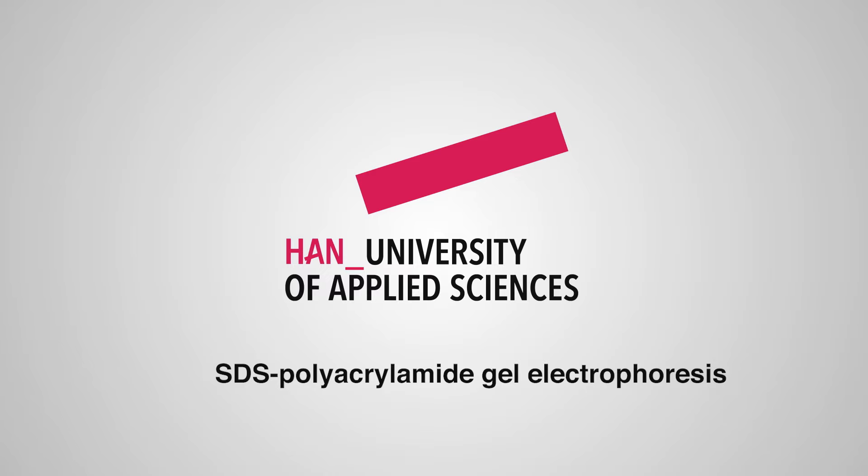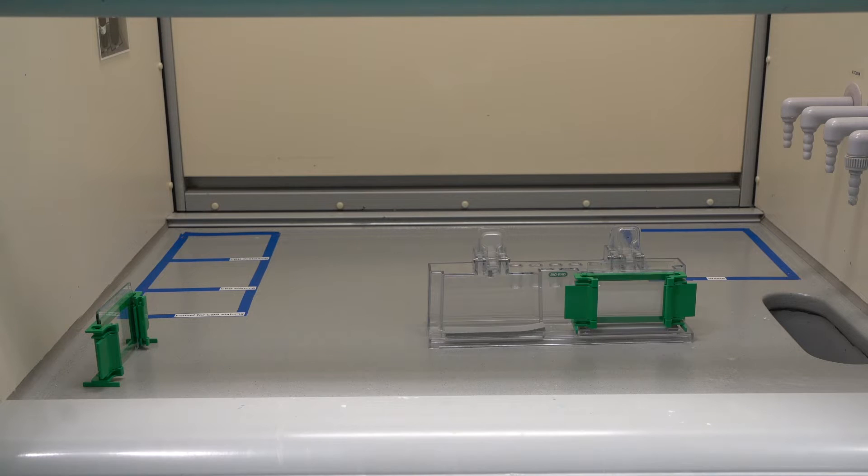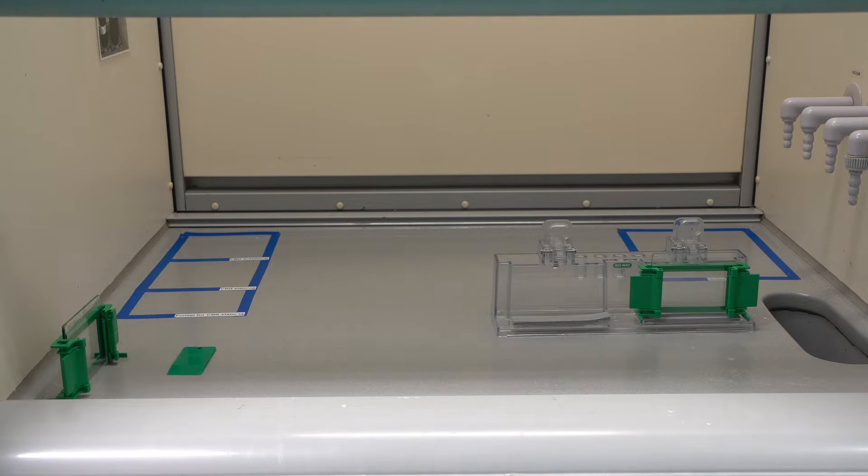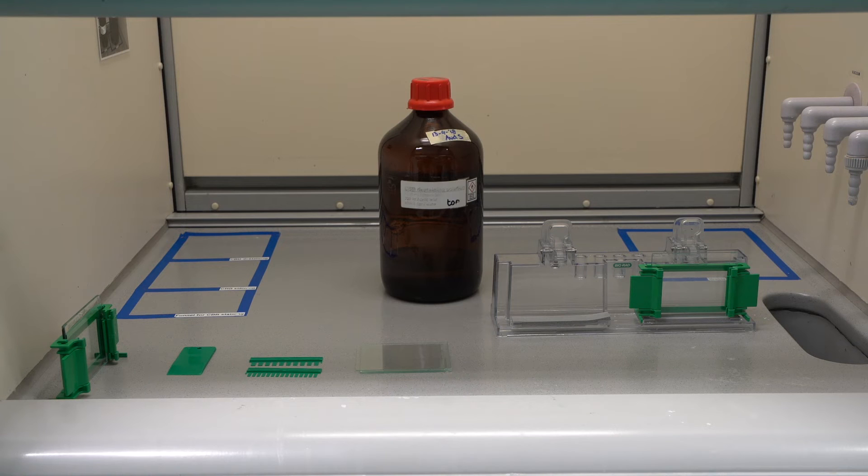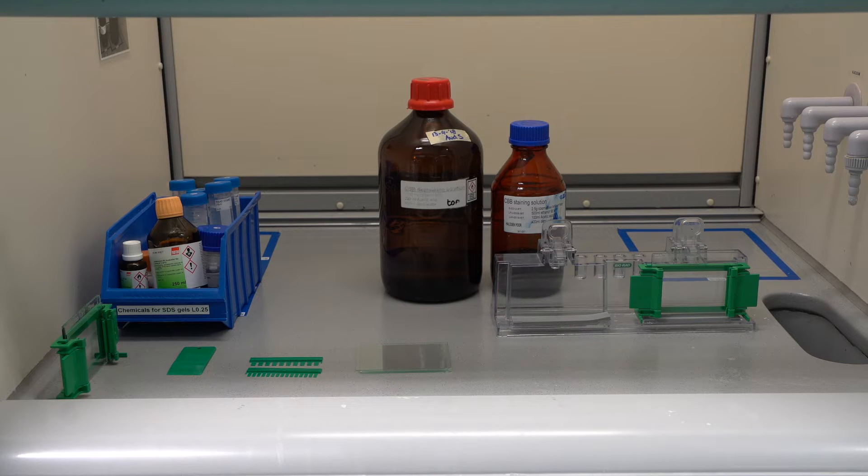SDS Polyacrylamide Gel Electrophoresis. You will need a casting frame, the casting stand and a rubber, green cutting aid, two glass slides, a spacer and a short plate, the green comb, de-staining solution, CBB stain, and SDS chemicals.